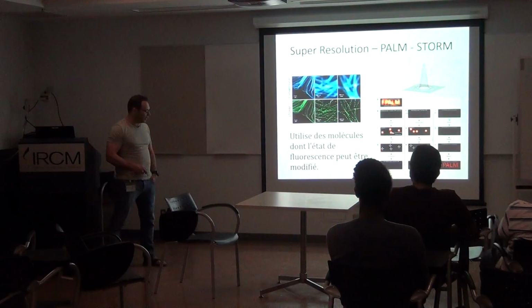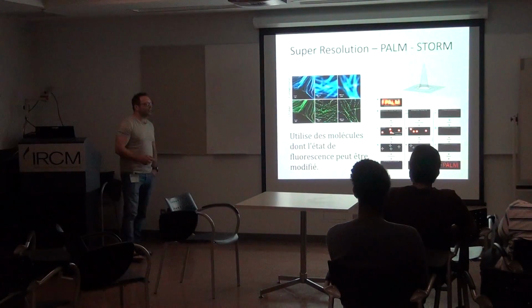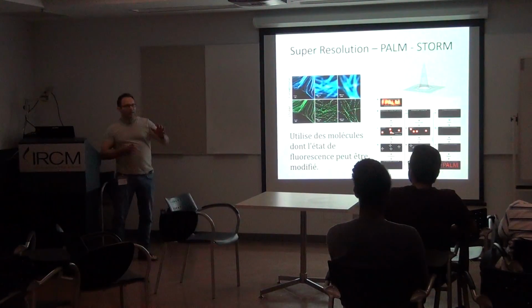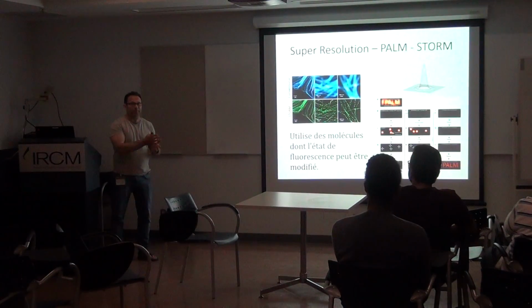You find out their center, and then from all those centers you produce a map in which you have only the centers, which will make something much more clear. Okay? So super resolution techniques use the fact that you don't look at or excite probes at the same time.